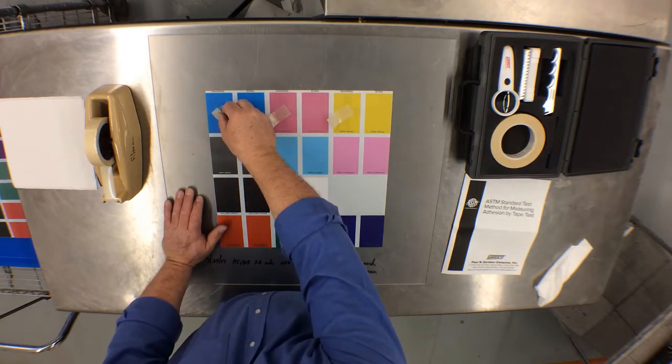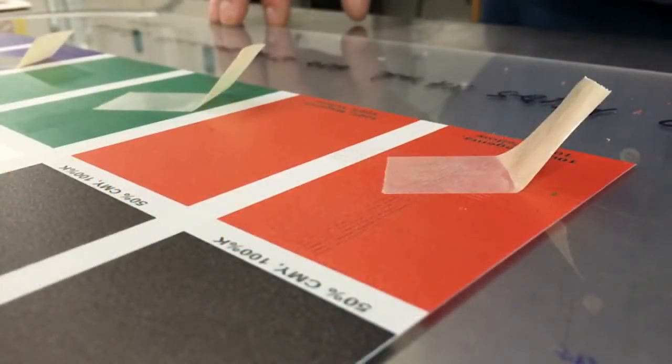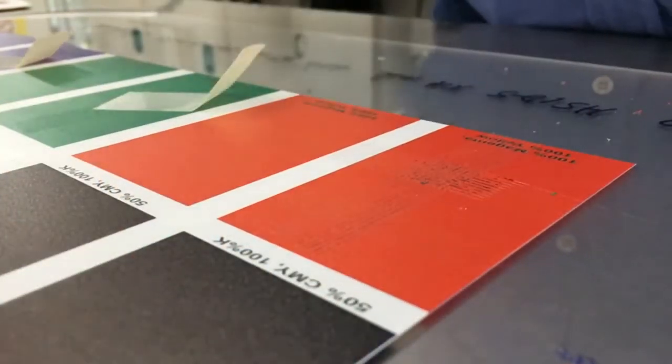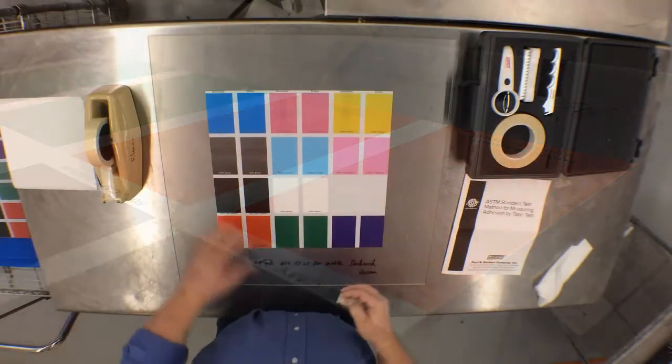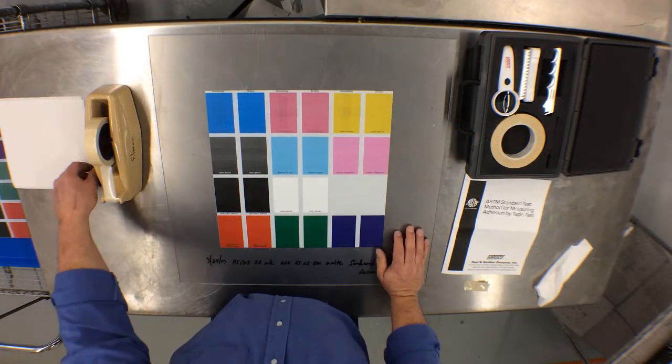Once the allotted time has passed, go ahead and pull the tape. Please ensure when you pull the tape that you pull across as opposed to pulling up. Now that that is complete, we will interpret the results according to the ASTM standards.